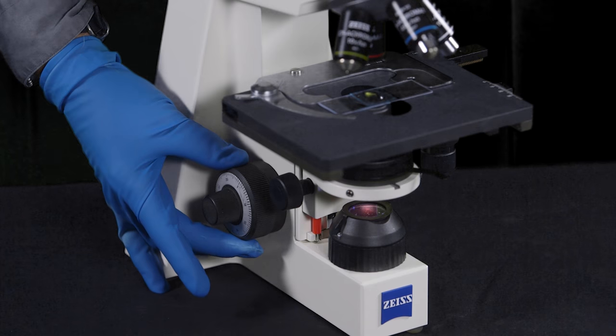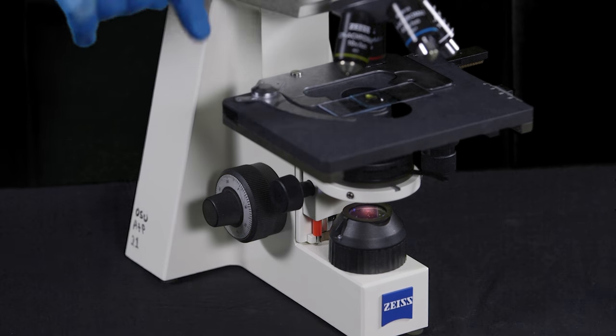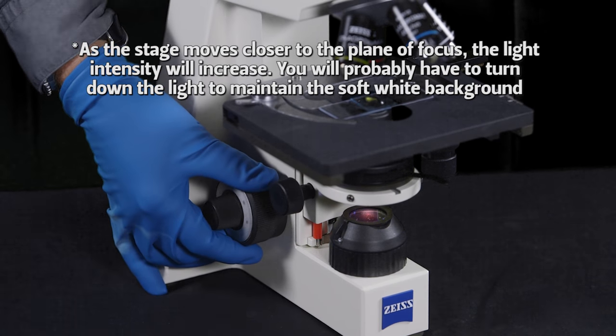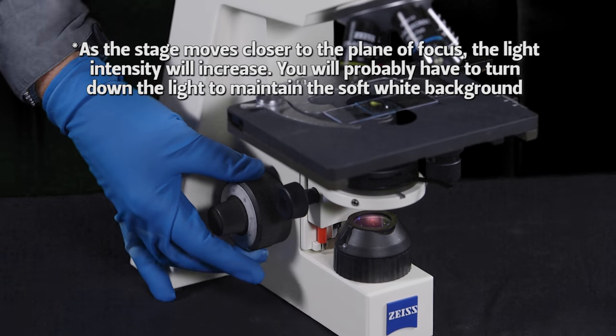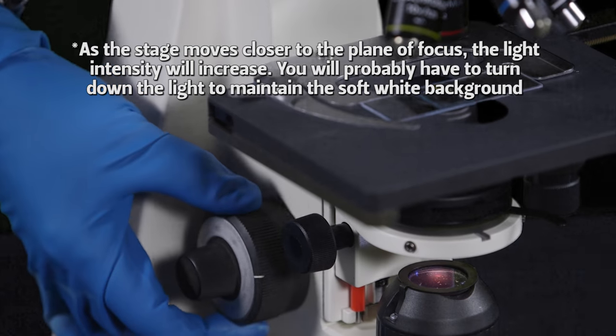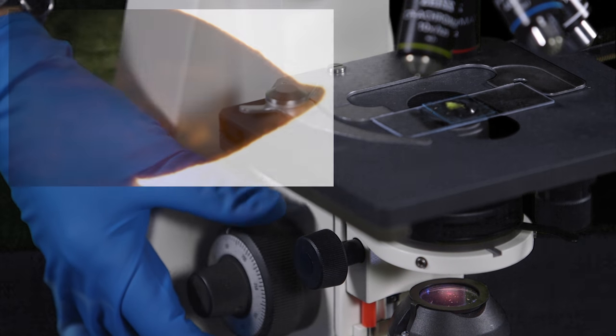When you are looking through the lowest power objective, you will be using the course focusing knob. Since you've lowered the stage all the way, you are slowly raising the stage until your specimen comes into focus.